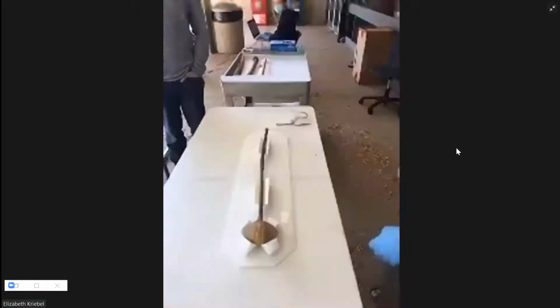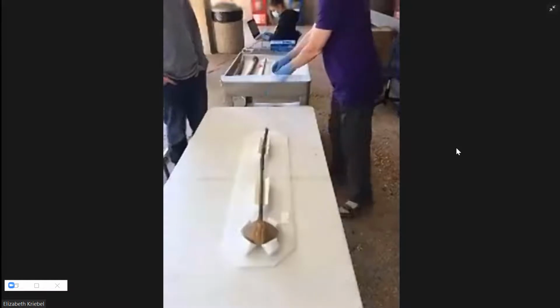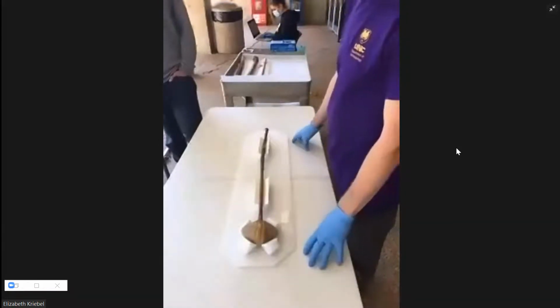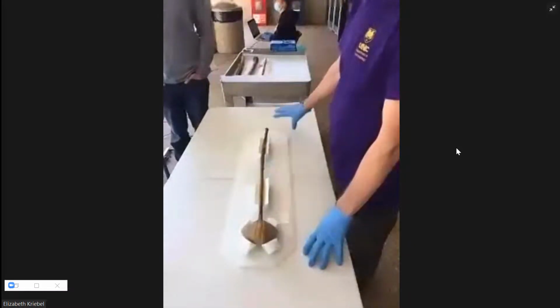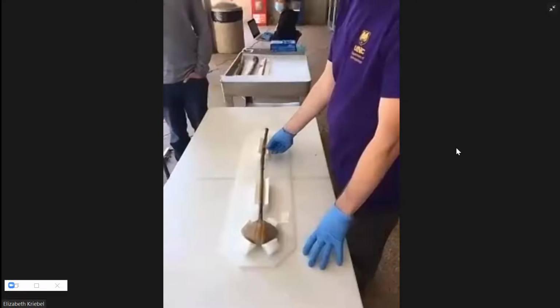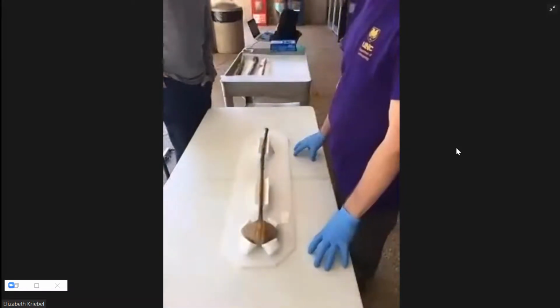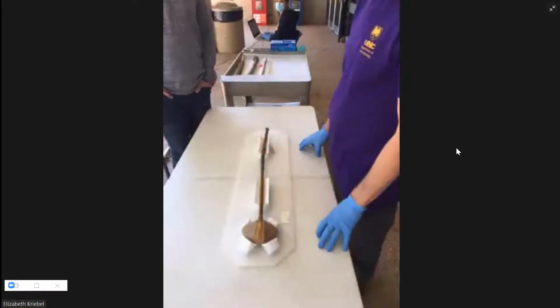Yeah. I think it was more likely display or possibly ceremonial, something like this, because it doesn't have any real damage other than the decay of time. And once again, our question here is, do we have any kind of application of arsenic, lead, etc., either as part of conservation or perhaps as part of manufacturing that will lead us to handle this with special precautions?